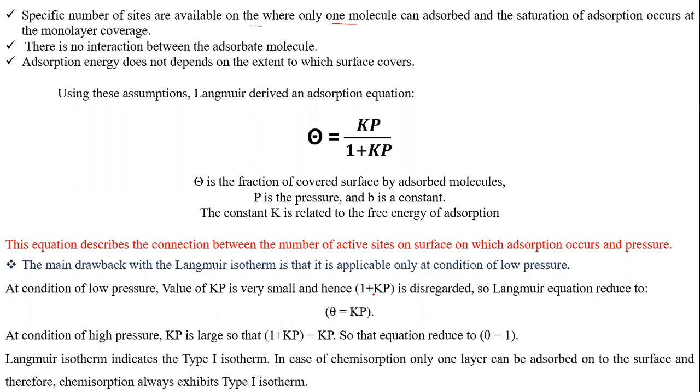That's why we call it a monolayer process. Then there is no interaction between the adsorbates. Next, adsorption energy does not depend on the extent to which the surface is covered. So there is no relation between the adsorption energy and how much of the surface is covered.